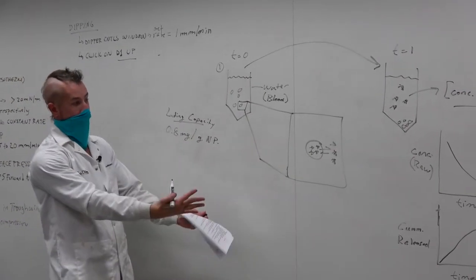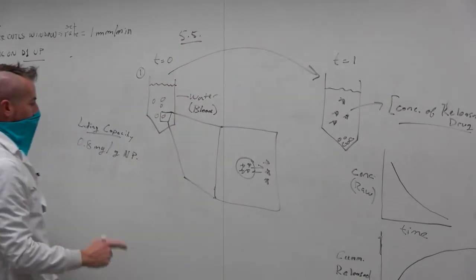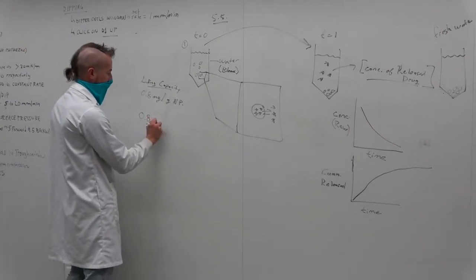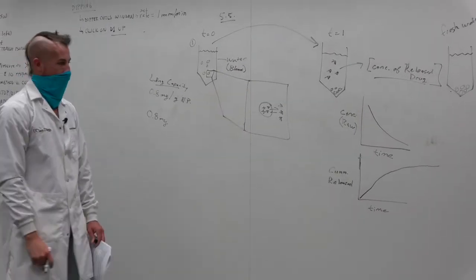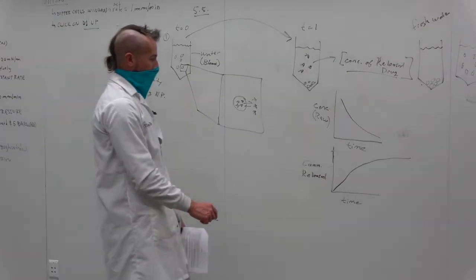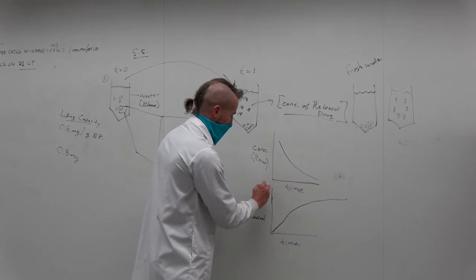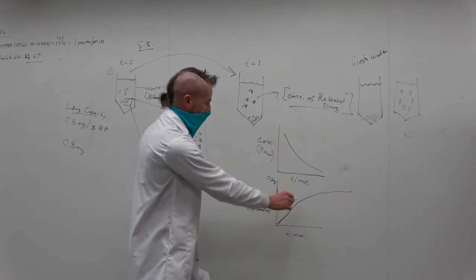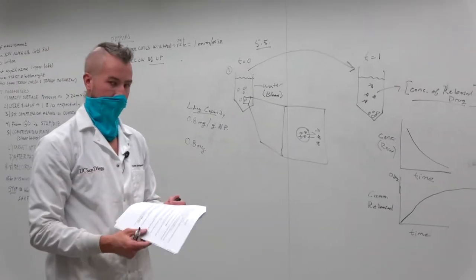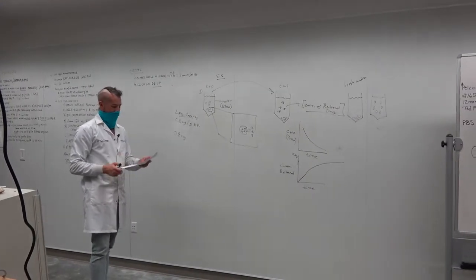and then say you did this experiment in section 5.5 with 1 gram of nanoparticles, you know that the most that can ever be released is 0.8 milligrams. So therefore, the max is 0.8 milligrams, and you would plot this as a percent of 0.8 milligrams. Okay? So these are the steps that you go through.